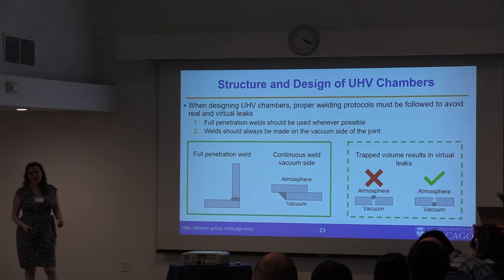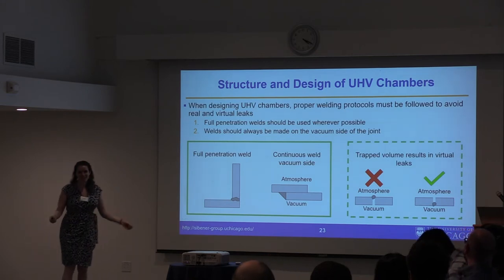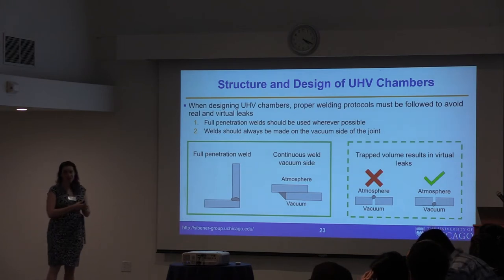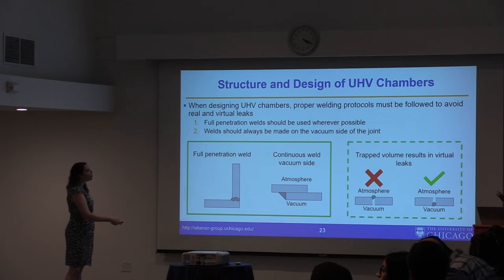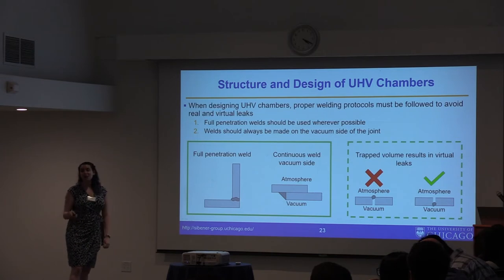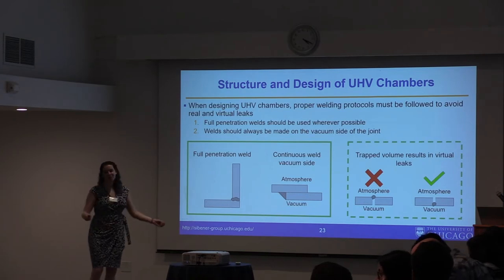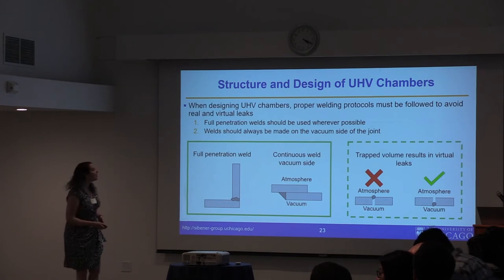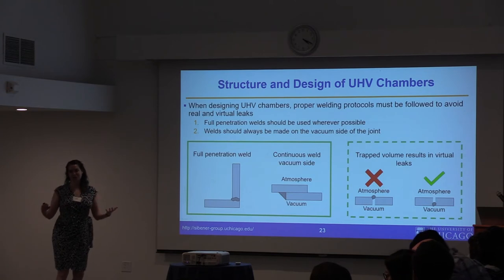When it comes to welds, UHV is constrained. There are two good weld types: a through weld or full penetration weld going through the entire junction, or a vacuum-side weld where you weld on the interior vacuum-facing side with no weld on the atmospheric side — giving full contact with no trapped gas. If you weld incorrectly — say an external weld on the atmosphere-facing side — you trap a volume of gas in your chamber, creating a virtual leak. You can bake and pump for years and never reach UHV. A partial weld on both sides also creates a virtual leak.